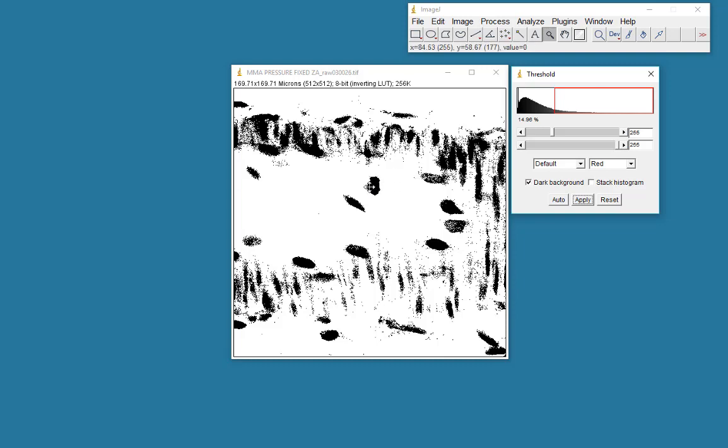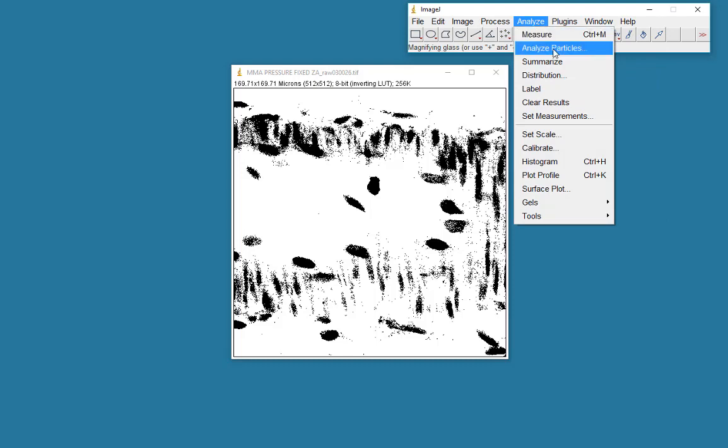Now having selected my pixels for measurement, I'll just remove my threshold now. I then come up to my analyze menu. And I want to analyze the particles.